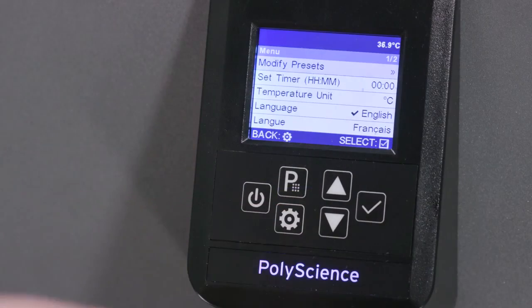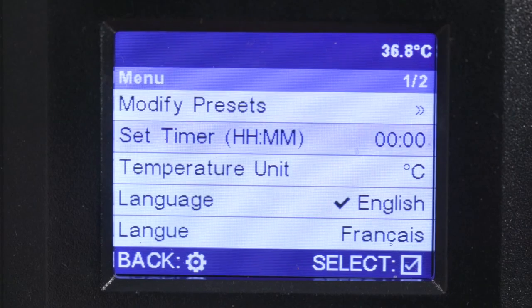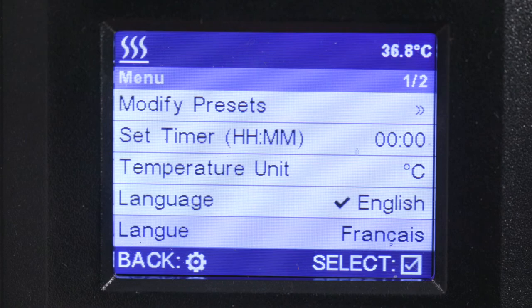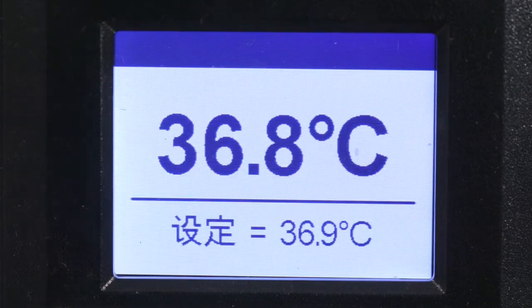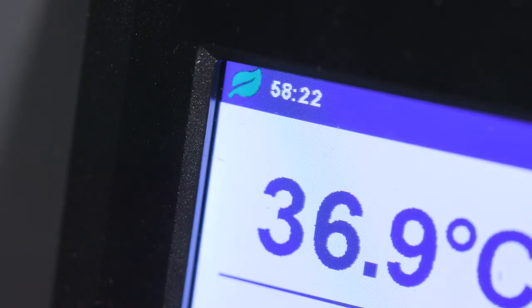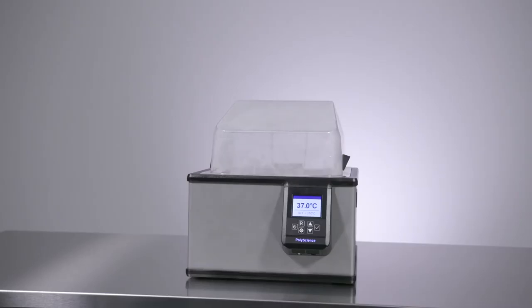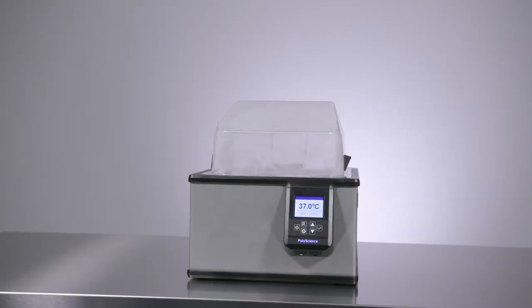These new intelligent water baths are the perfect blend of control, convenience, safety, and of course budget.